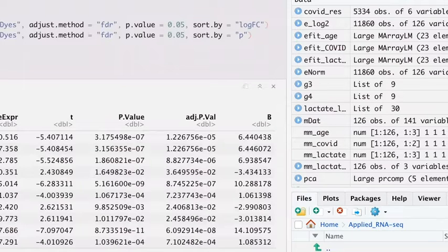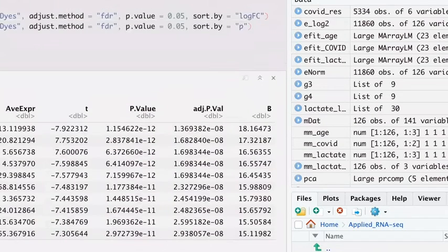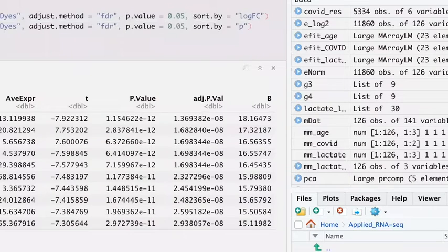So this variable does indeed change the results that we see. And so that's what I mean. You have to be careful when you're selecting which variables to include in your model, because if you did include it, the results you're getting are different. But if we check by p-value, it doesn't seem to change.